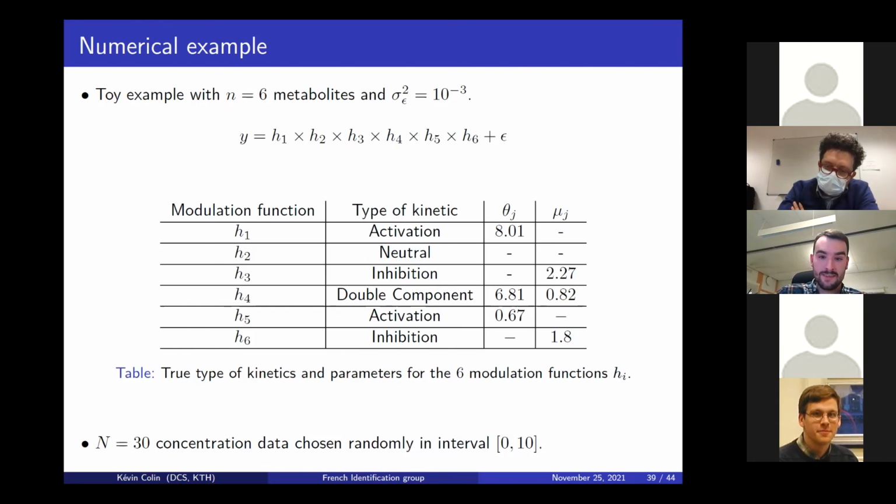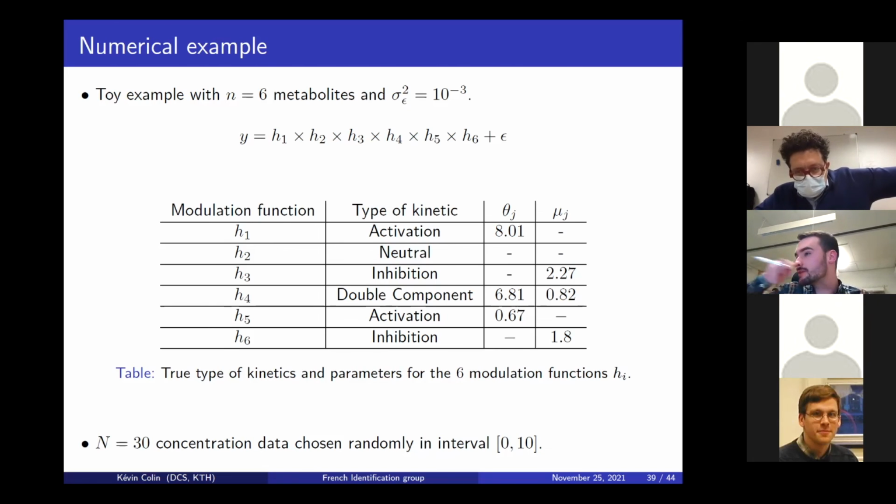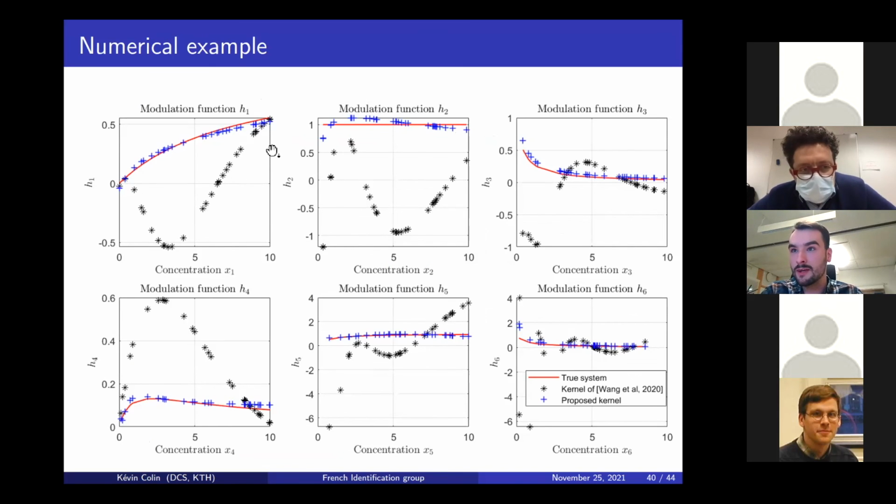The problem that can arise here directly is a problem with the data. If you consider the prediction error identification framework, for instance, if you have a problem of data informativity, like you don't have enough richness in your data, you can have a lot of problems in the modeling. That may be what happened with the black one here: if you do the multiplication at the end, you have a very good model. But the model itself, the latent variables, are kind of bad. So this could be explained by a richness of data.